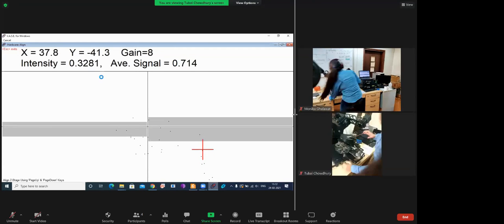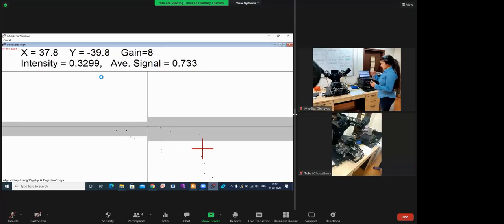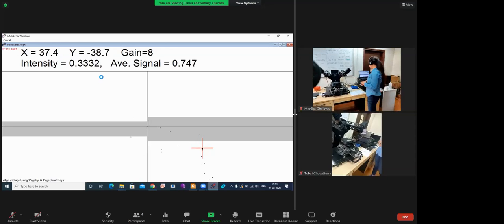Sometimes if you are taking glass substrate or anything which is very transparent, it happens that the gray rectangle will disappear. So you have to recheck whether your detector is getting the signal or not by seeing that black hole in the detector. The white spot should be inside that black spot.